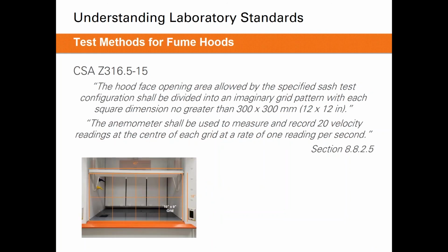These next couple standards here we'll go through a little bit more quickly, as they do refer back to very similar test methods as ASHRAE 110, but I'll try to highlight some of the potential differences or criteria that they outline in these standards.